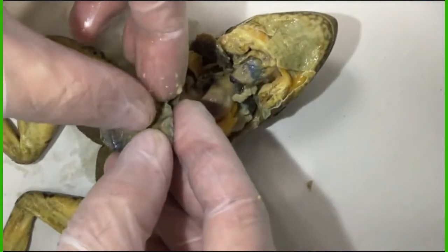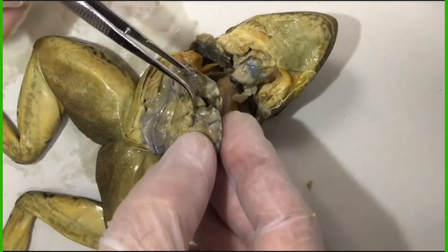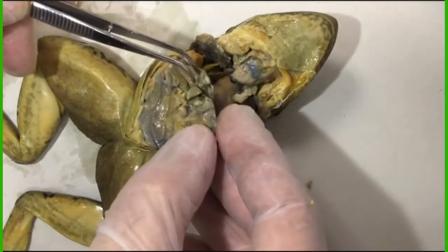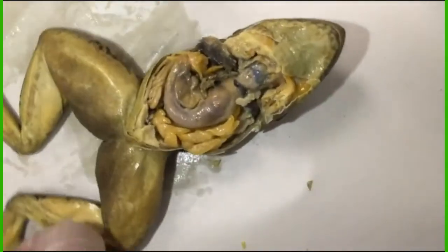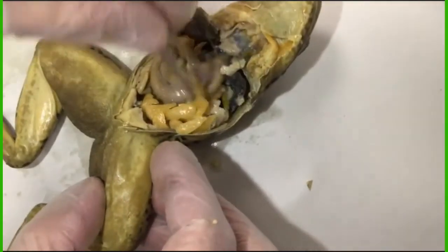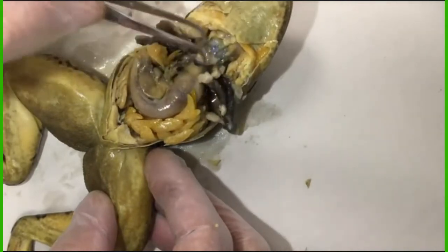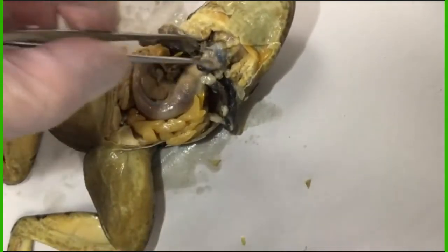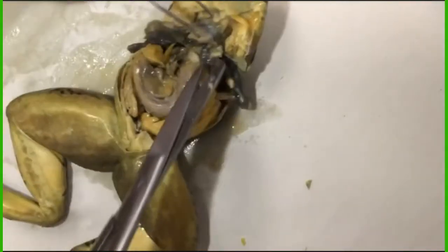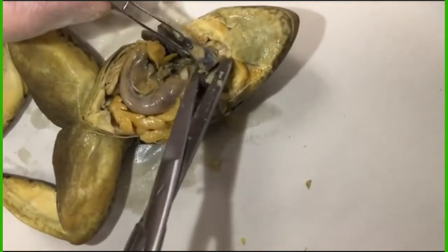In other words, it's got three big parts. There's the gallbladder right there, tucked in underneath it. I'm holding it with the forceps. That's the gallbladder. And the three lobes of the liver, an extremely large organ in the frog. It's large in us too, but it's really big in comparison to the size of the frog. There's one lung. There's the other lung. That's the heart right there. And again, it's just attached with some tissue underneath, and snip around it carefully so that you can keep it in one piece.